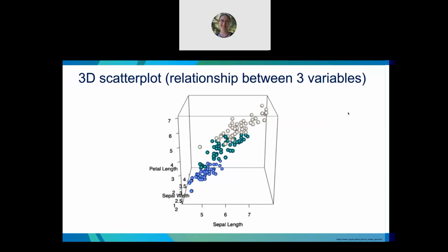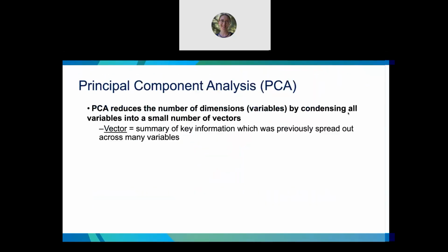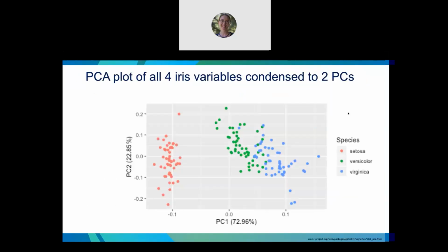And the best angle of sight is what we get if you could now scroll down to the picture of the PCA. That's the best sight angle. There's one place you could stand in my house where you'd look at the fish tank and this is what you would see. And when you look at it this way, there are fewer points hiding behind other points, and there's minimal interesting stuff going on that you can't see. Most of the interesting stuff is visible here.